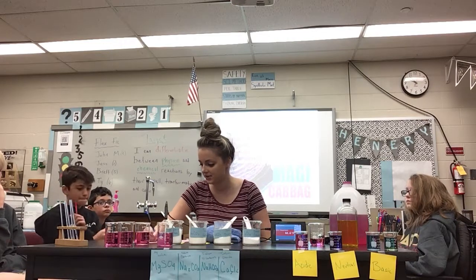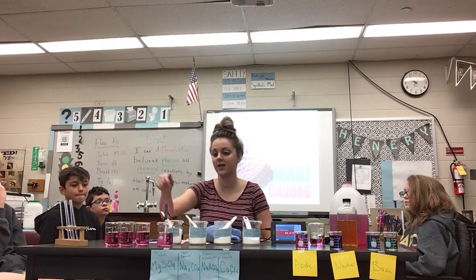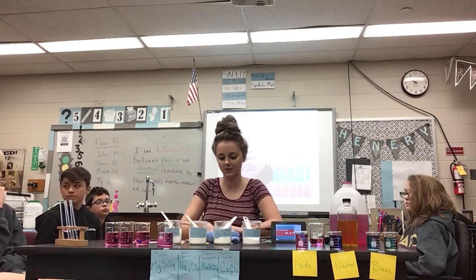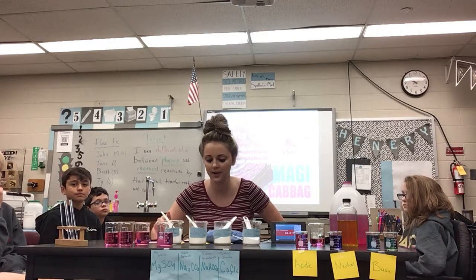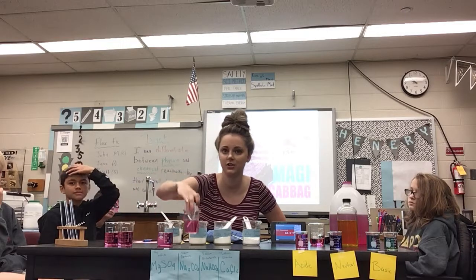68.6. All right, we're staying there. Let's get rid of that. I'm just gonna lay this right here. Okay, number 2, we're gonna do sodium carbonate. So again, here's sodium carbonate.